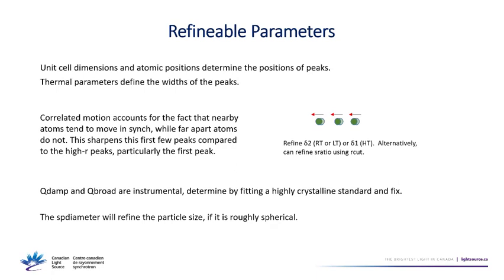And if you have a particle which is spherical or roughly spherical, you can even refine the particle size in the small box fitting. PDFgui has a parameter which will model the size of your particle, assuming it's a sphere, based on how fast the PDF falls off.